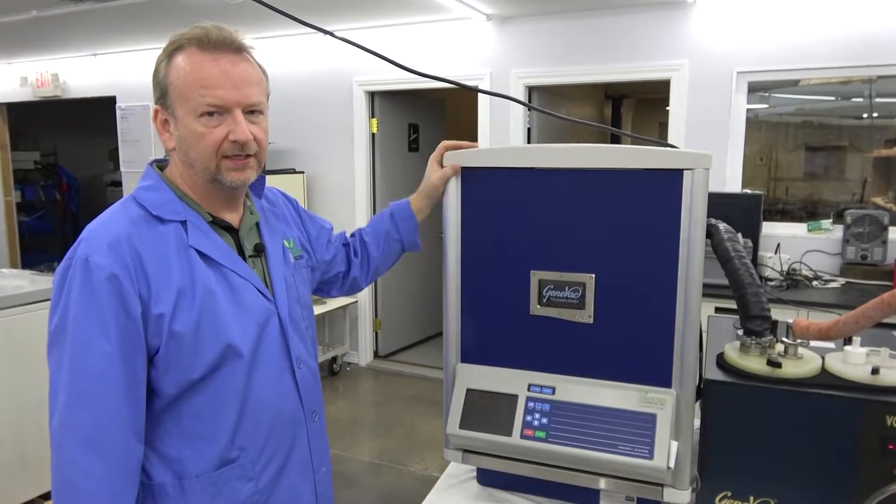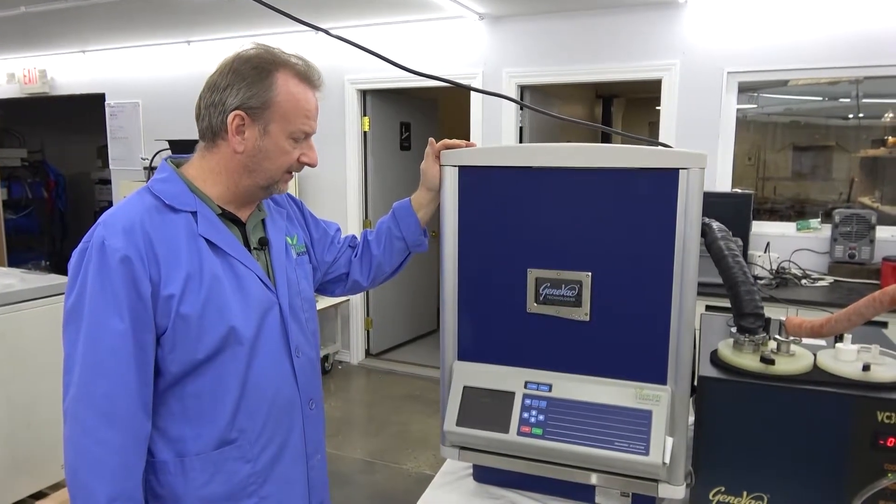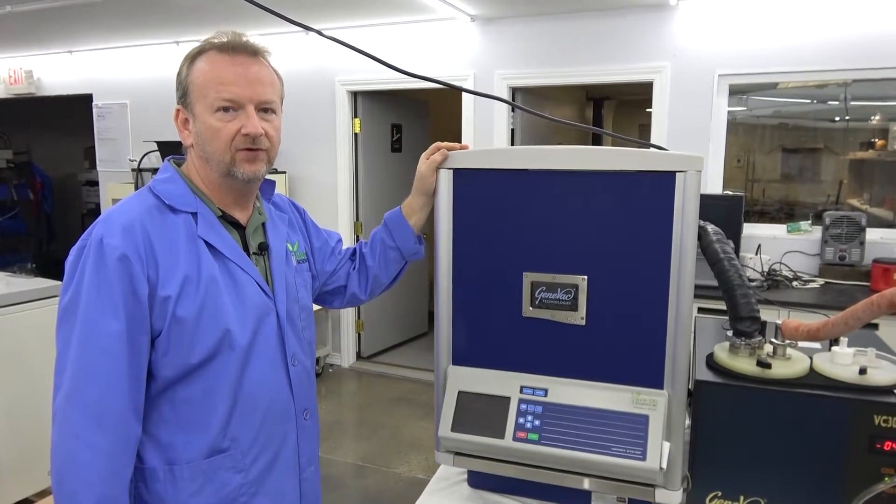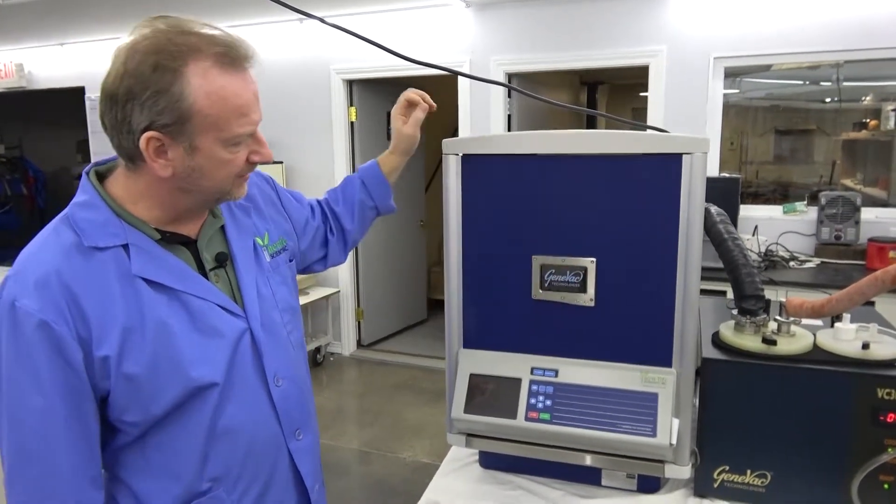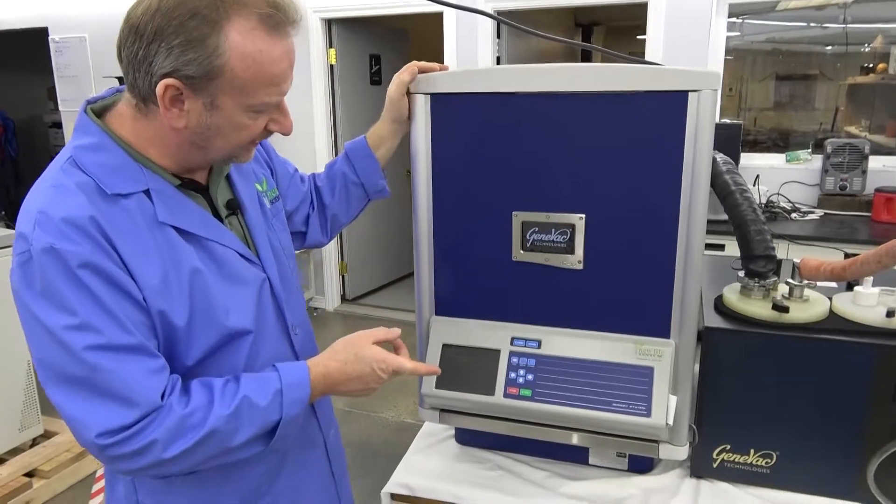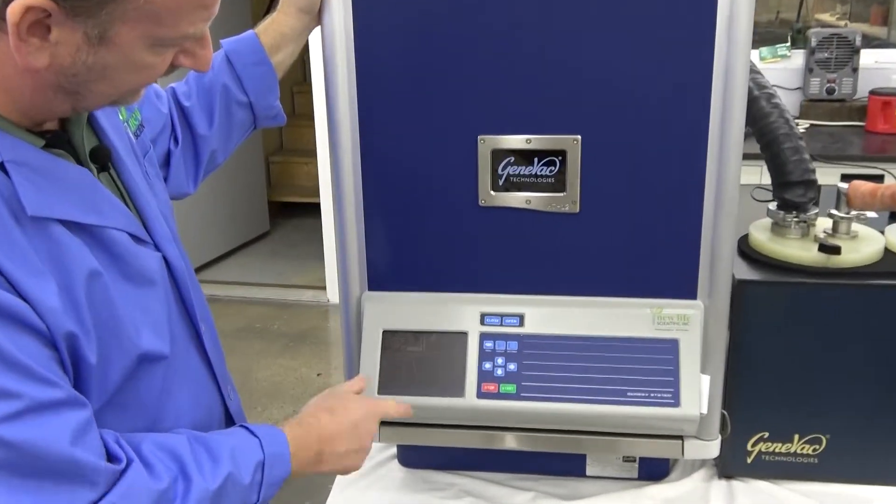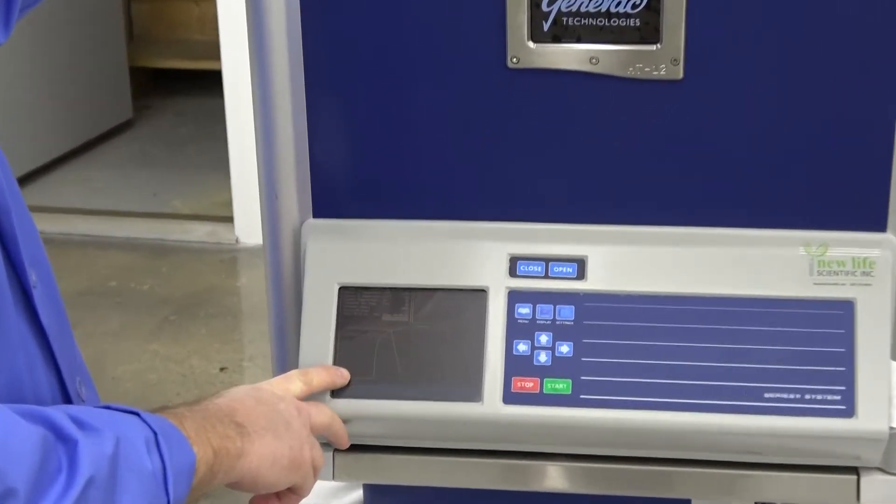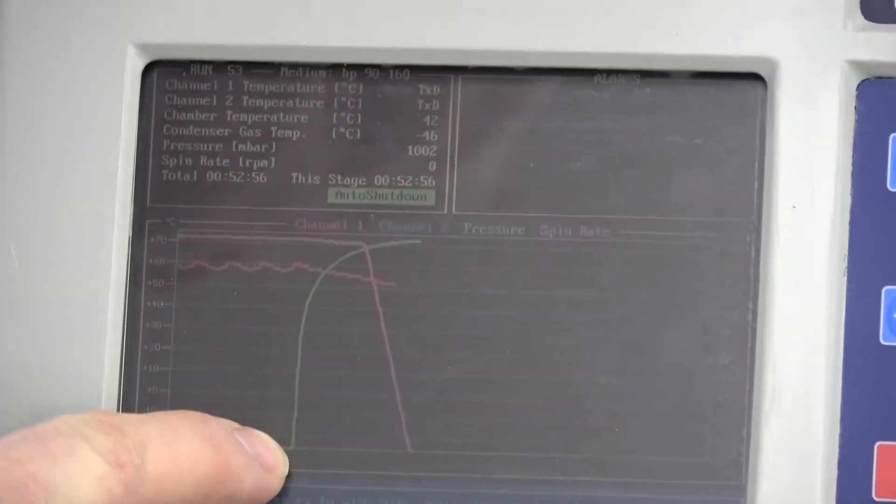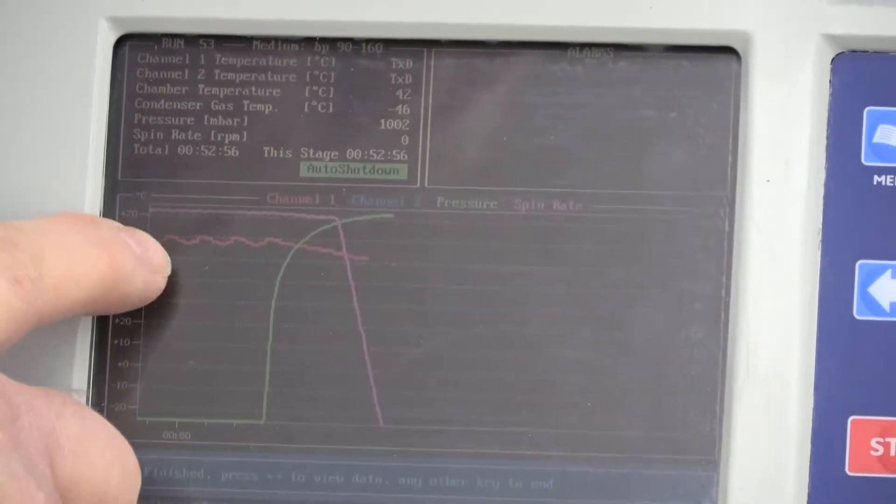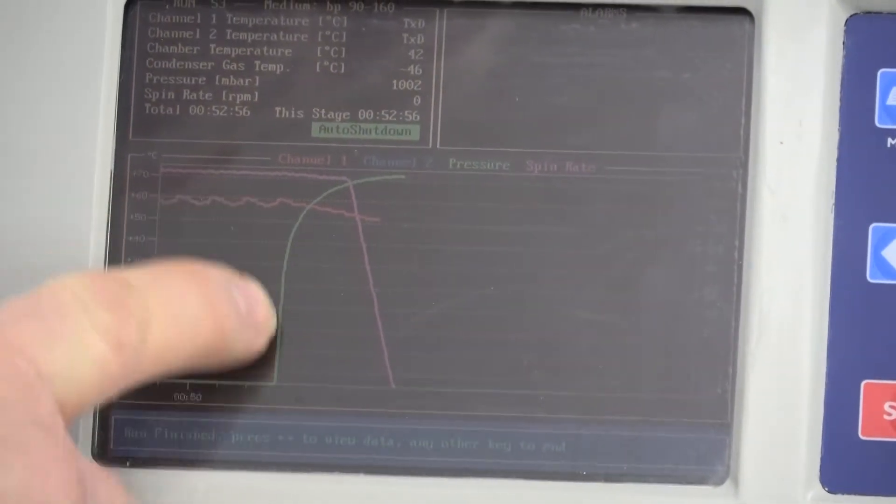All right. So we've ran a program on it, and we're looking to have all the water evaporated. It should have went from here into the condenser there, but I just went ahead and shut it down a little bit ago and let everything spin down. You can look at the panel here where I pulled the vacuum all the way down to zero, and it ran for quite a while, and then the heat was up pretty high here, too.